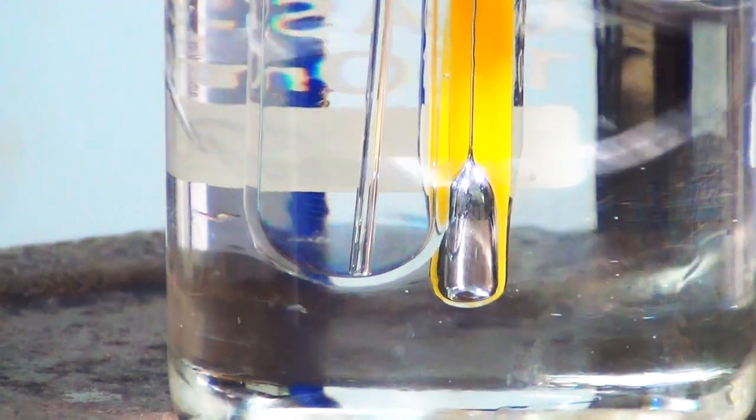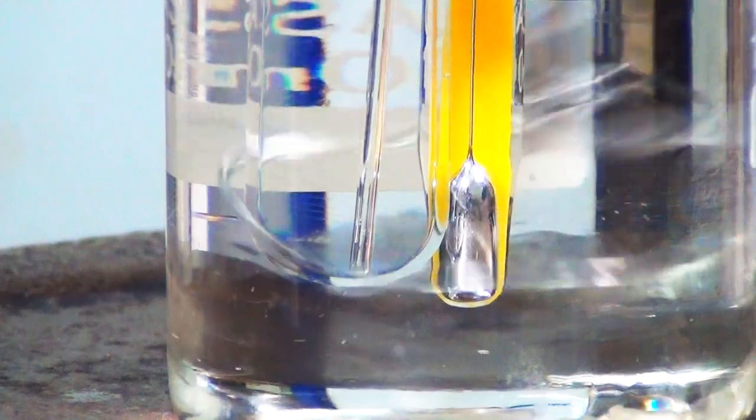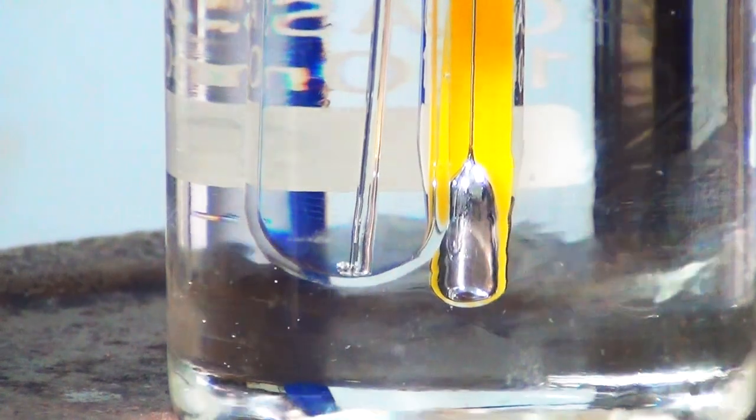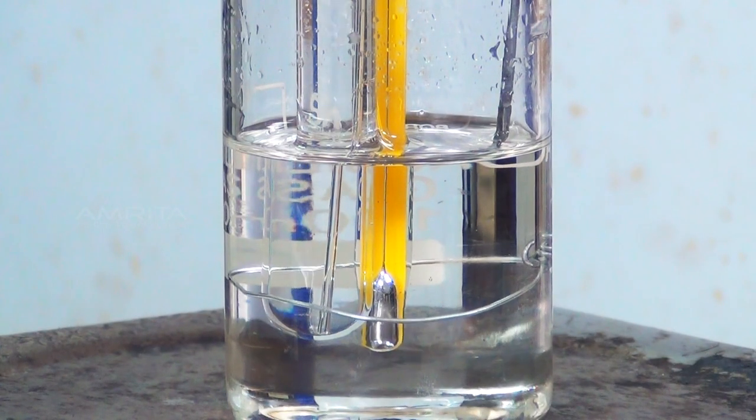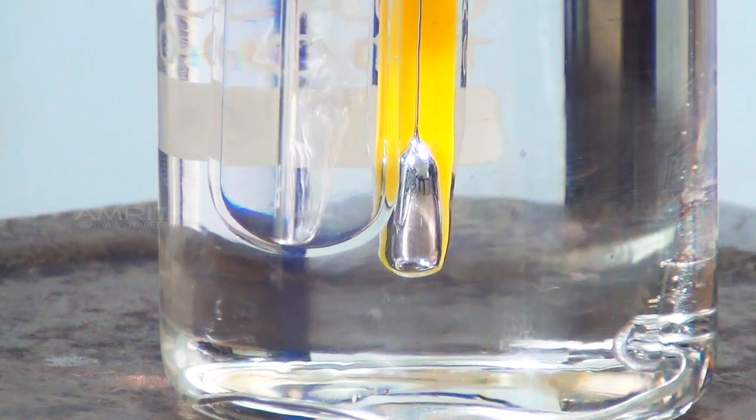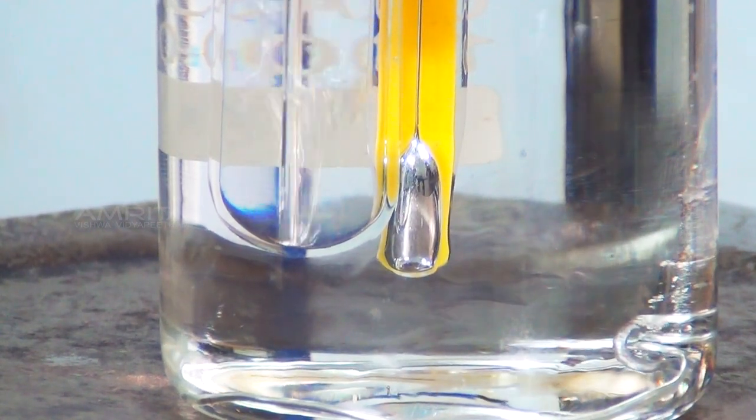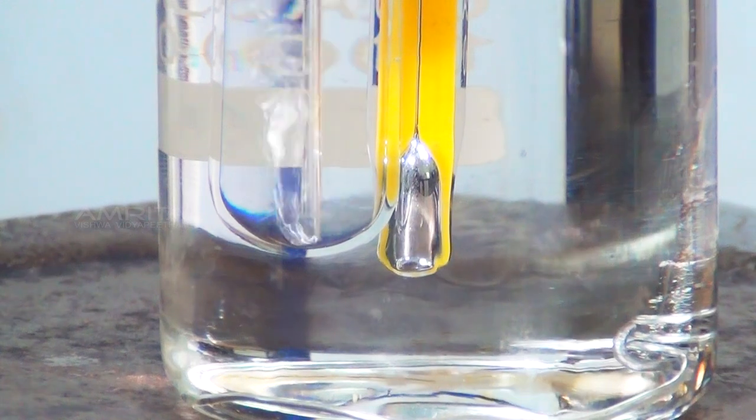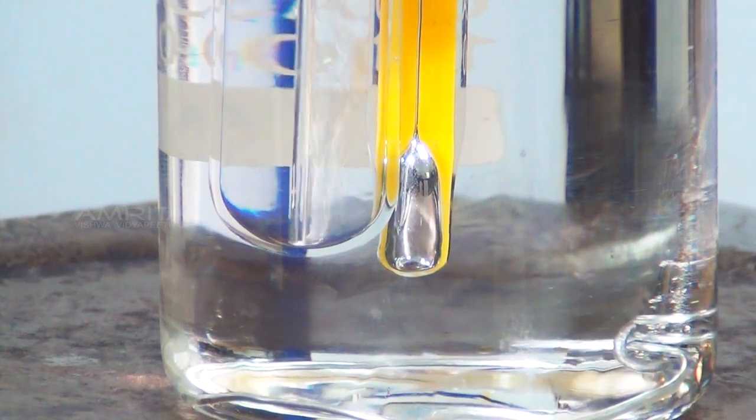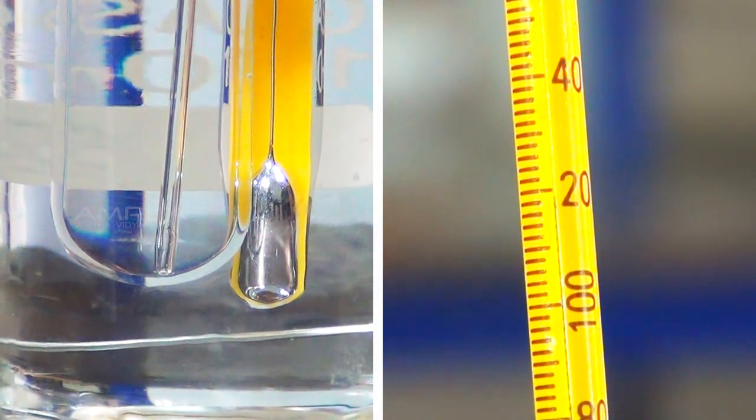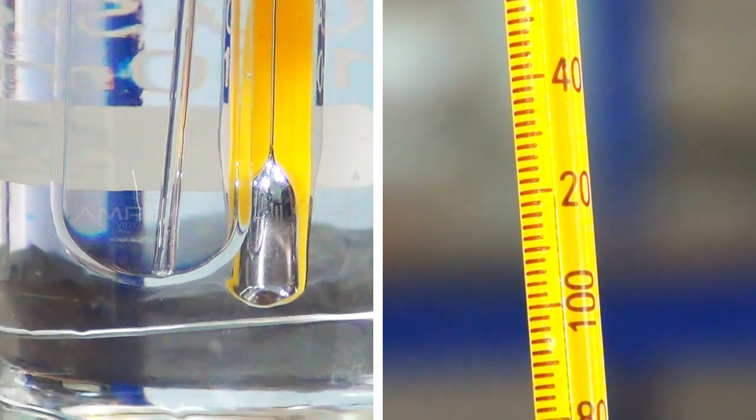At first, a bubble or two will be seen escaping at the end of the capillary tube dipped in toluene but soon a rapid and continuous stream of air bubbles escape from it. At this stage, the vapour pressure of the liquid just exceeds the atmospheric pressure. Note the temperature T1 when continuous stream of bubbles start coming out.